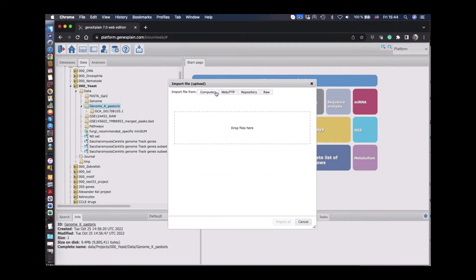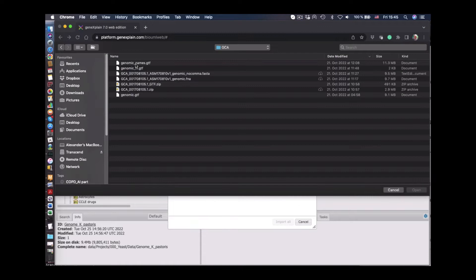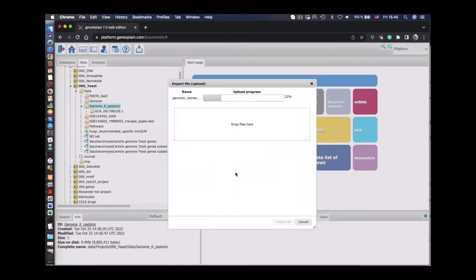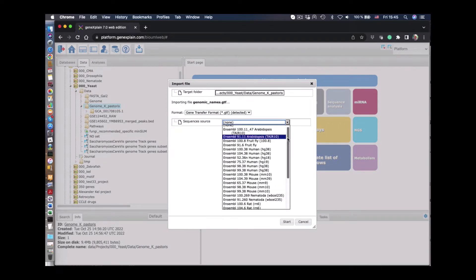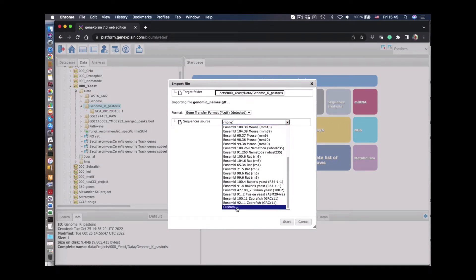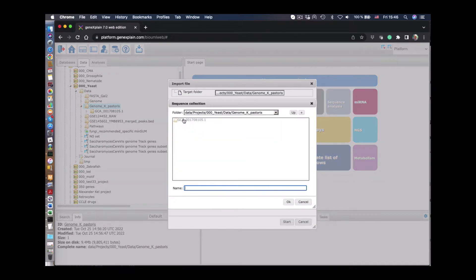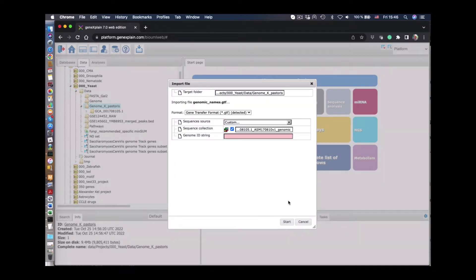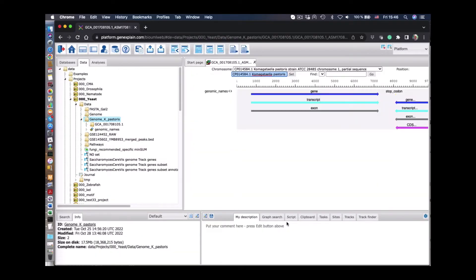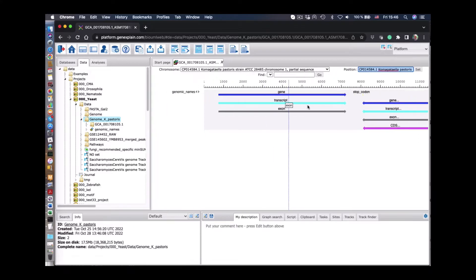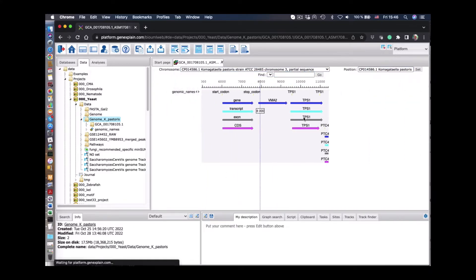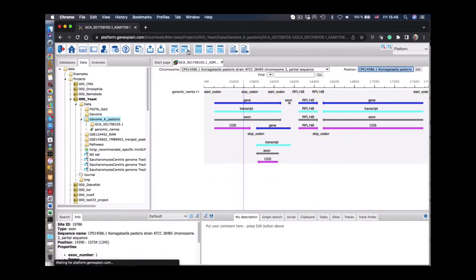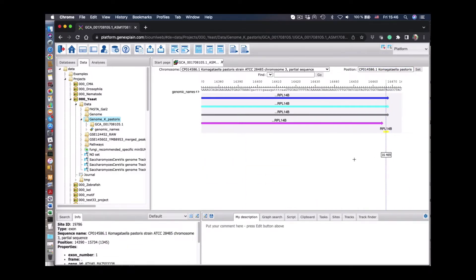After that we upload this file into the GeneXplain platform and define the source of the sequence — the genome. In this case it's a custom genome which we have just uploaded in the platform, and now the annotation is recognized and it is visualized in the genome browser. We can switch between different chromosomes and we see the annotation of the genes, transcripts, and other features in that genome.